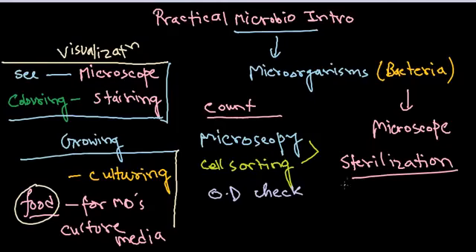So sterilization is very much required, and probably one of the most important things you should take care of before even visualizing growing them, because sterilization comes first. So you need to sterilize them, and for sterilization you can use different sterilizing processes. You can use chemical sterilizer, but mostly we use steam sterilizers called autoclave, which means steam sterilizers.